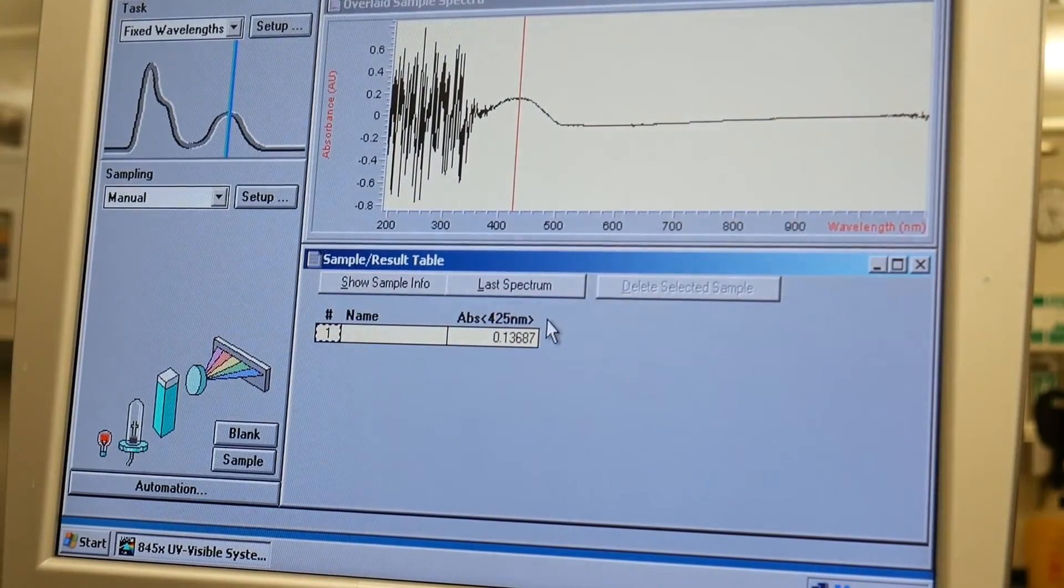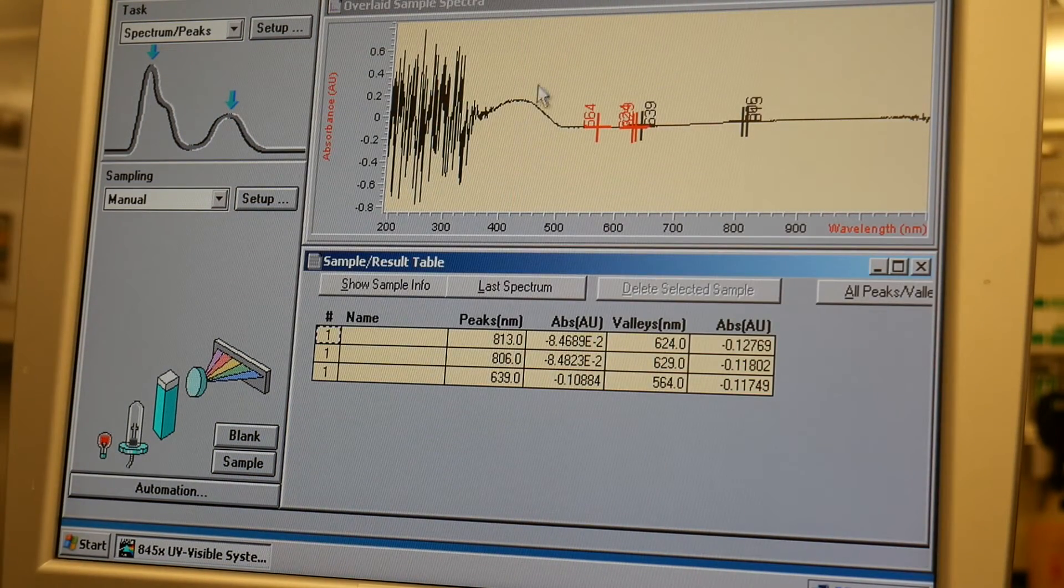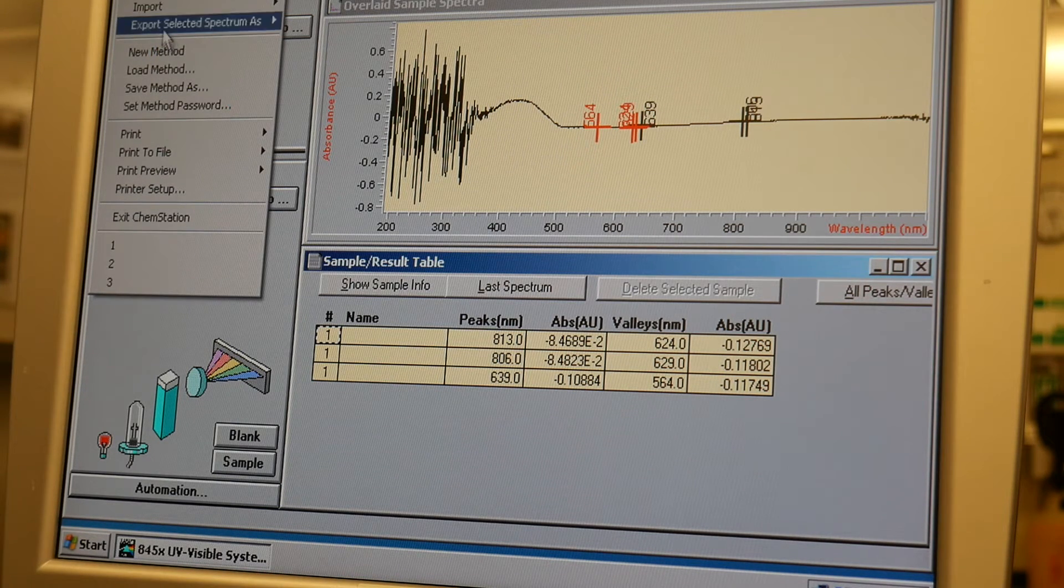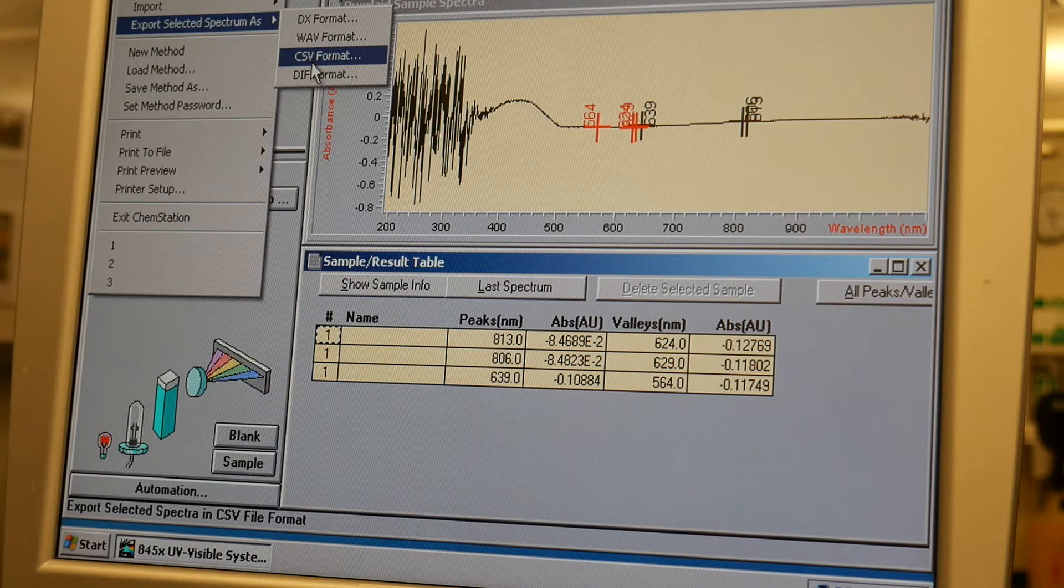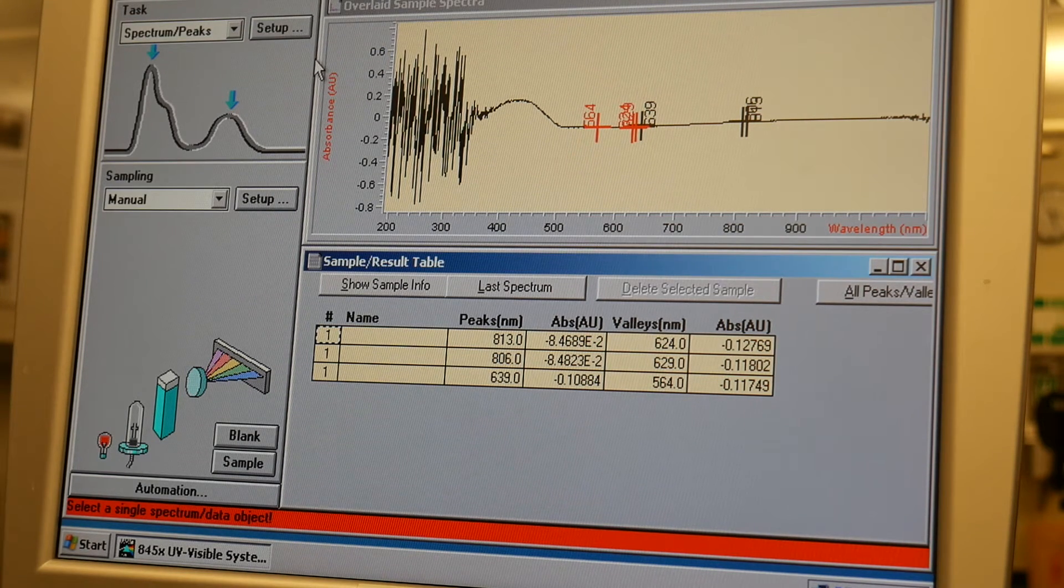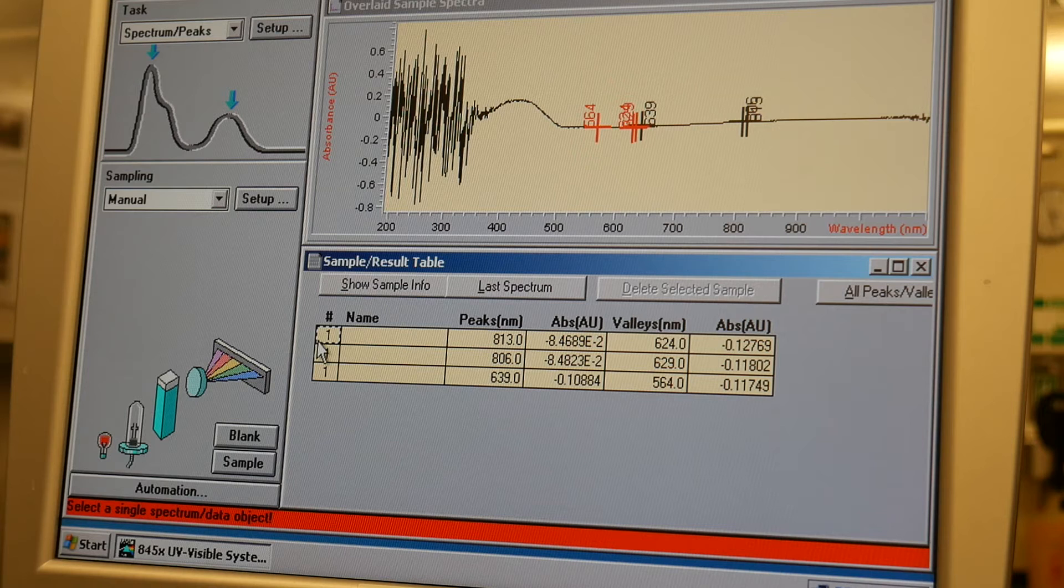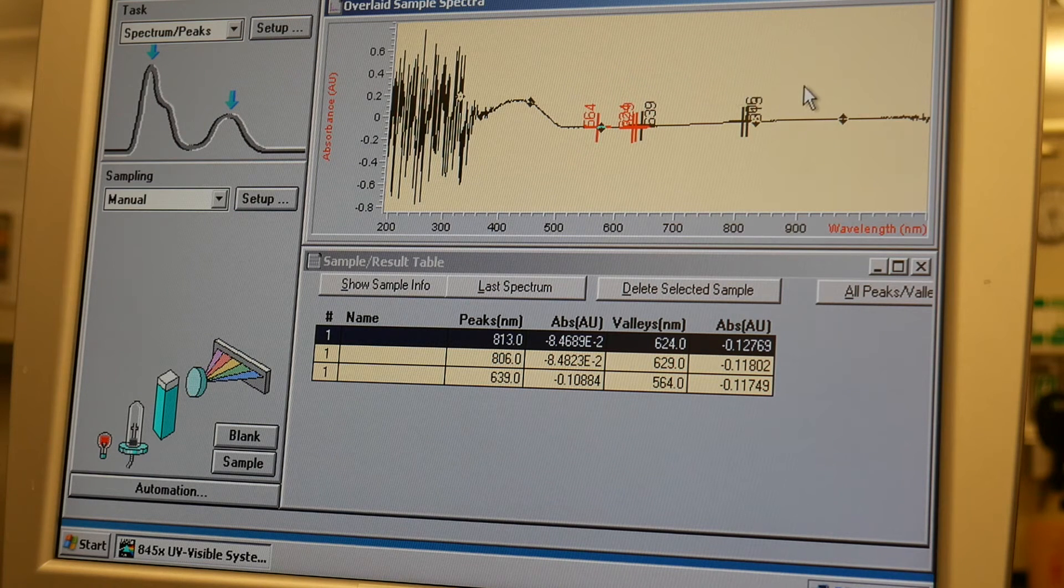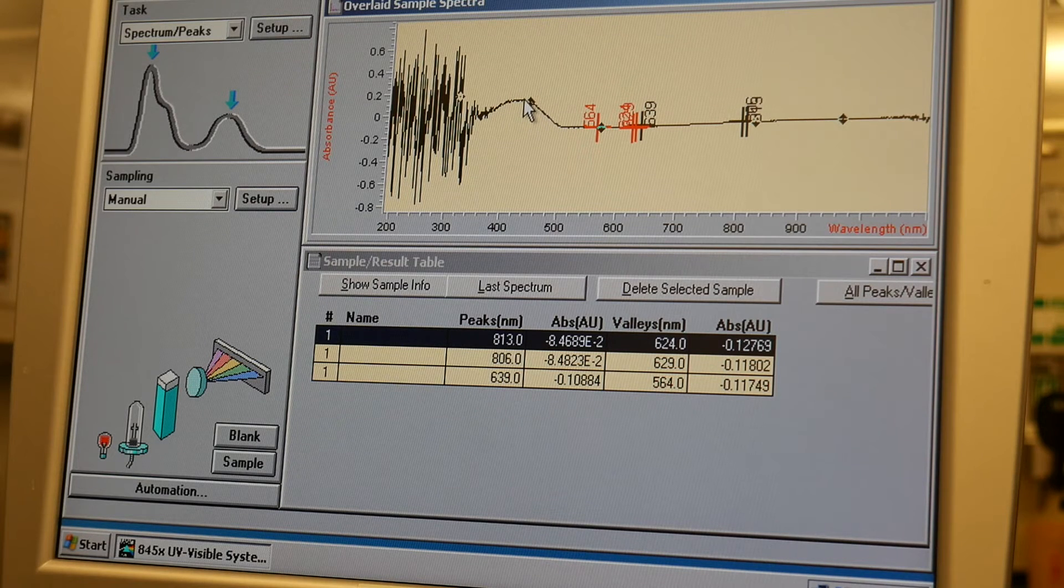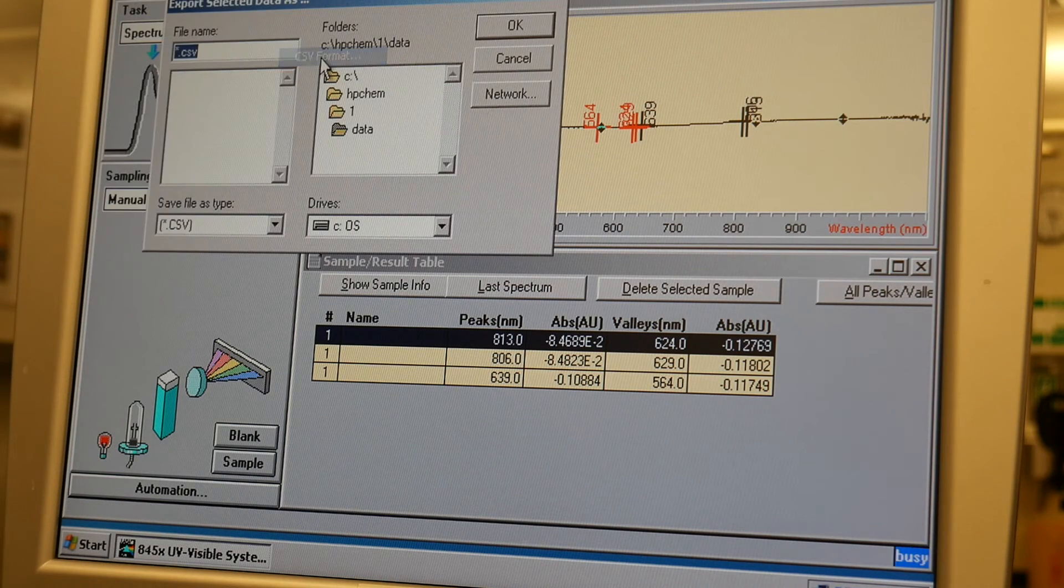So if you're just getting absorbance data, sometimes it is a little easier to just write down the absorbance. But if you want to save a spectrum like this, you can go to File, you can go to Export Selected Spectrum, and what you want to do is you want to export it as a CSV format. And that is something that you can import into Excel later. Okay, now one of the things you have to do is you have to select which spectrum you want to export. So if you have a whole bunch of spectra on your screen, which is something you can do, you have to click on one of them. So in this case, I just clicked right here. So now I'm going to export the selected spectrum as a CSV.